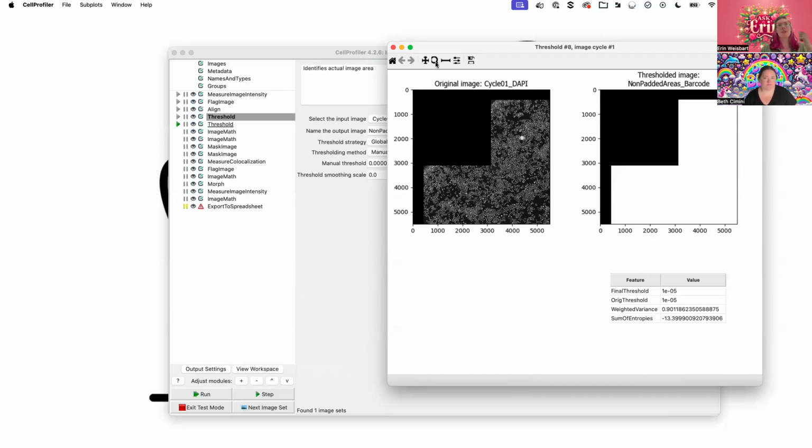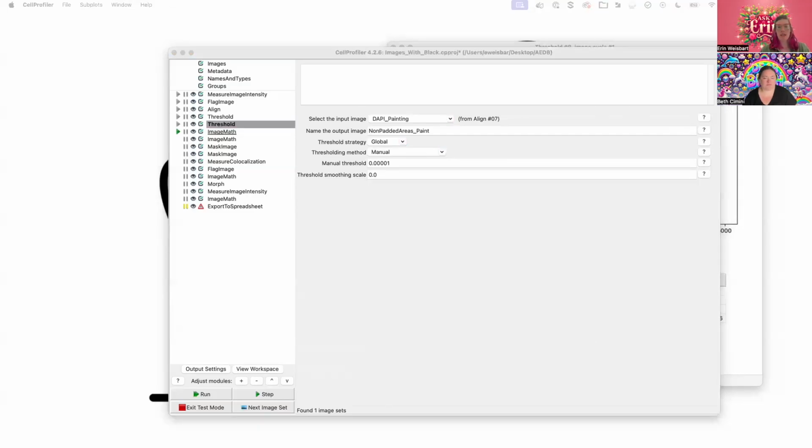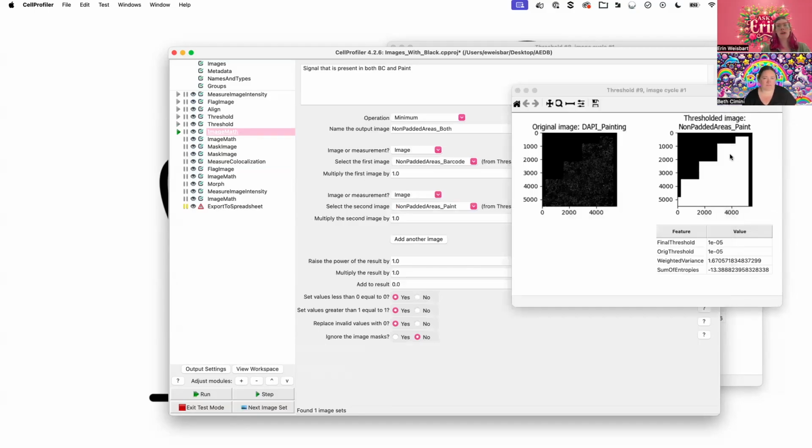It is zeros in these images, which is why this set of tricks works. I do the same thing with the other image and get a slightly different stair step, which looks like this.